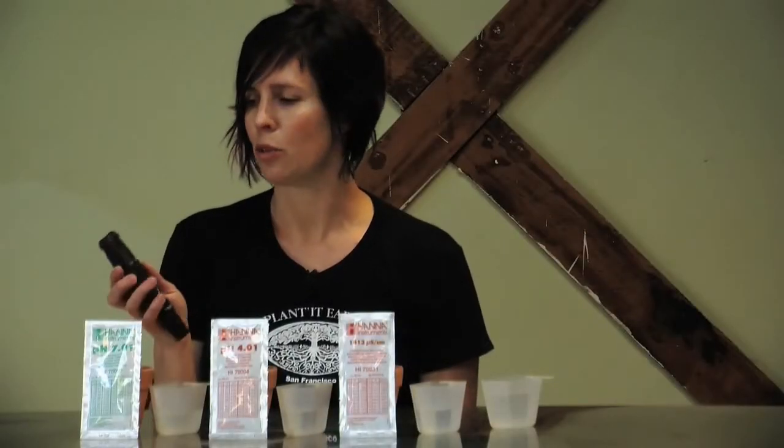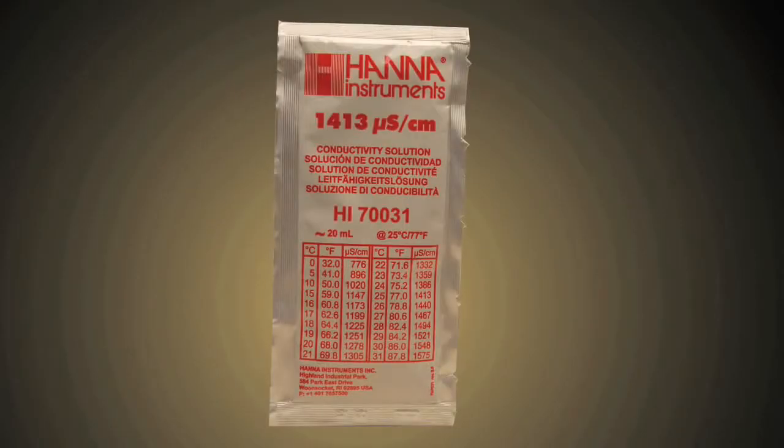We're going to calibrate the EC and part per million of the Hanna 98129 pen. To do this you want to be in the EC mode. This will calibrate both the part per million and the EC mode. You'll want to use the 1413 solution.